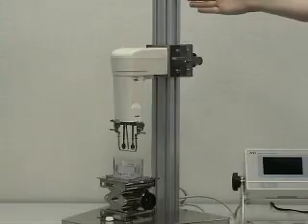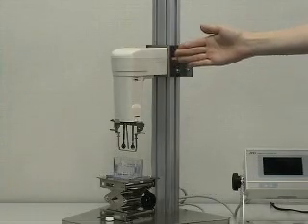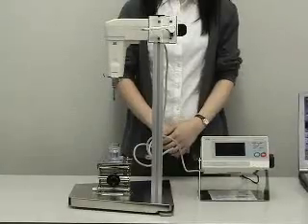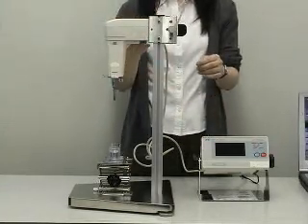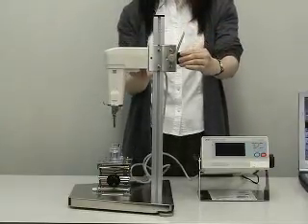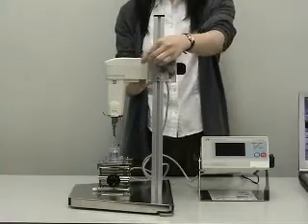The main unit has a stand, and the sensor unit is fitted to the stand. The position of the sensor unit is adjustable. Loosen the lever and support the sensor unit. Pinch and hold the grip, move the sensor unit, then release the grip and fasten the lever.